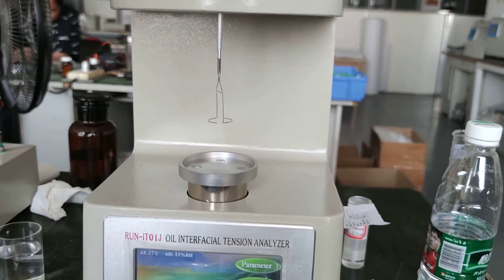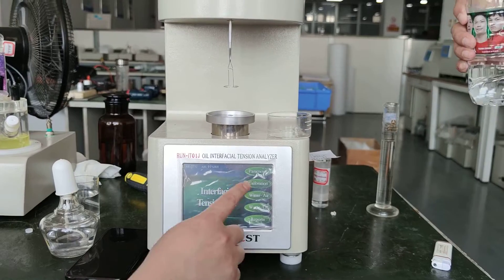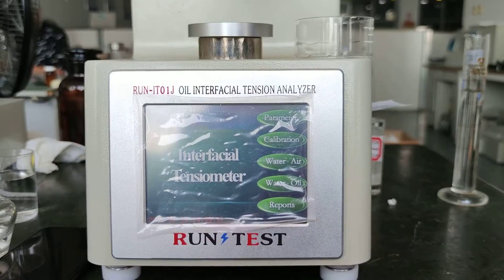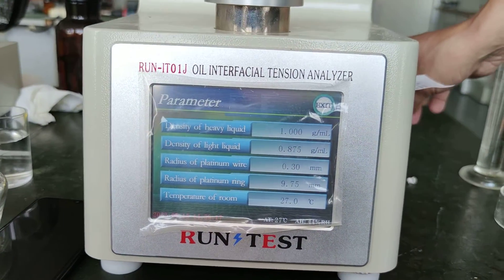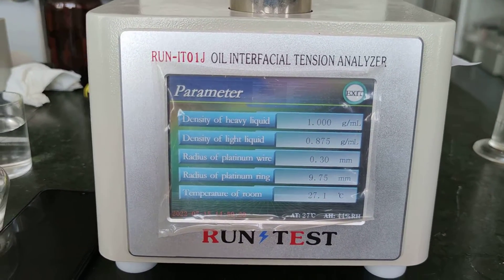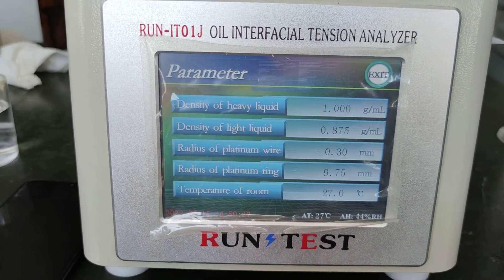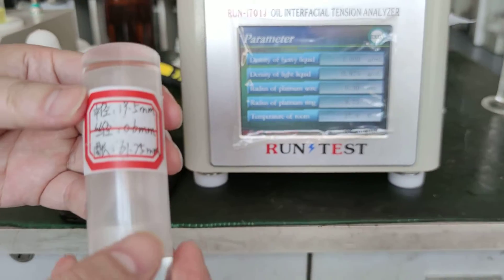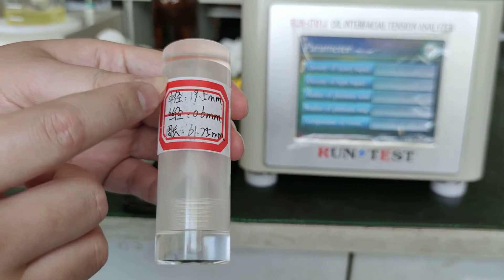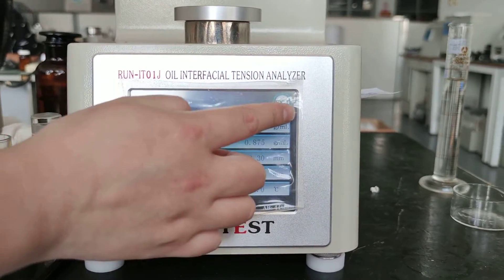Then we can close the cover. We follow the test procedure and set the parameters first. The density of the heavy liquid is the density of water, and the light liquid is the density of the oil. Also input the dimensions of the platinum wire and circle. Once all parameters are set, exit.